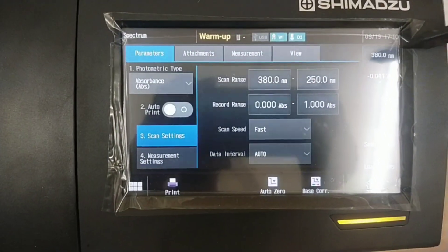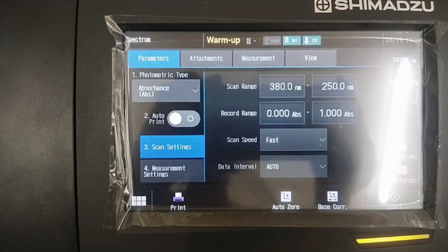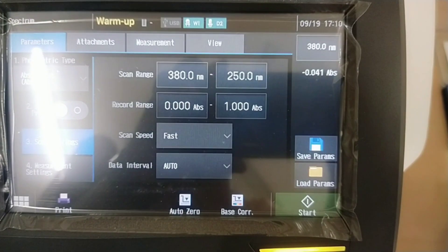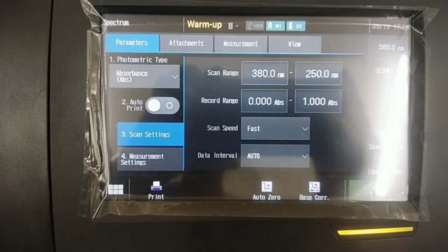Spectrum mode is for wavelength scanning over a continuous wide range — that is 190 nanometers to 1100 nanometers. Enter your wavelength range, scan speed, and data interval.